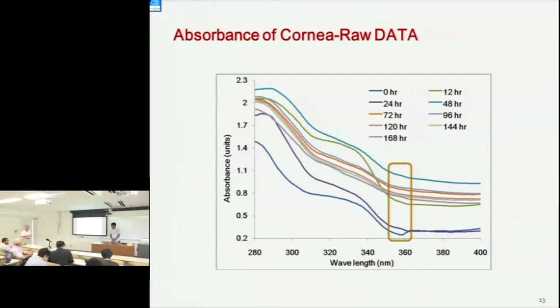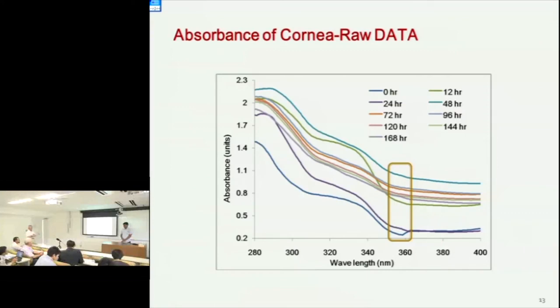When you prepare the samples, before your measurement, for example from 0 hour, it's only one sample. After every measurement, we keep the sample cell in an airtight polythene bag and store it in water. When we measure, we take it out of the water, take the data, and again put it in water. I worry that the relation between the sample and the water changes over time. But the water temperature is 20 degrees Celsius, not changed.